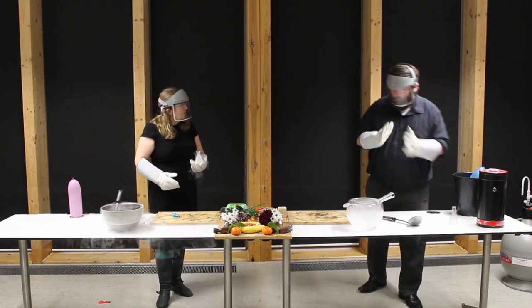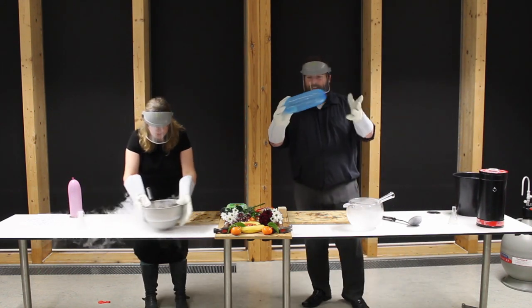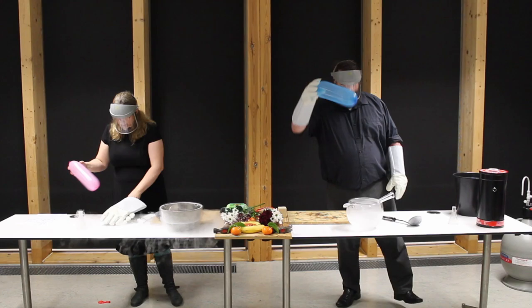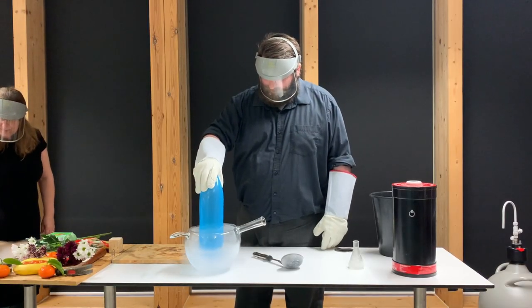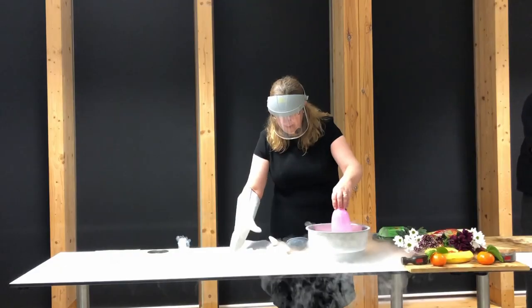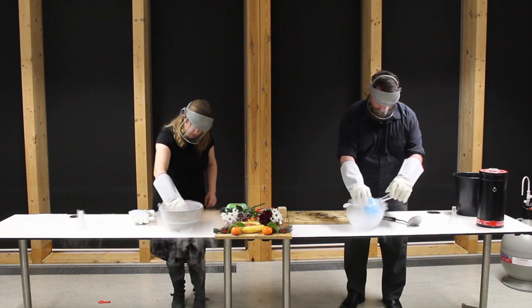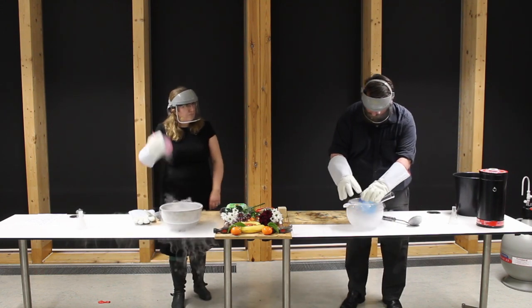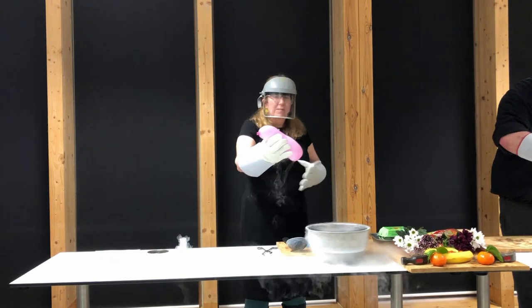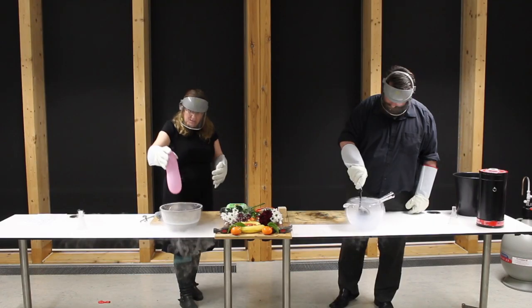But there's another way we can show the effects of liquid nitrogen with balloons. Indeed there is. So here we now have a balloon filled with air. I believe this is Miss Jarvis's air. Thank you very much, Miss Jarvis, for donating this. And what we can do is cool this down. Now what you'll notice, very obviously, is our balloon starts to get smaller. That's not because the air is escaping, it's because the air is changing into a liquid. And it gets smaller and smaller and smaller. And then when we take it out, Miss Jarvis's breath starts to change back into a gas and it starts to expand. I'm going to put mine back in, I think.